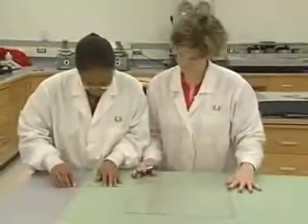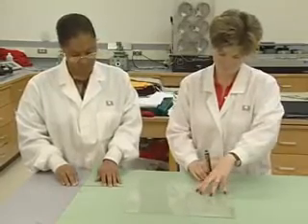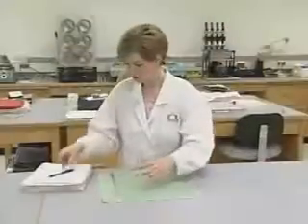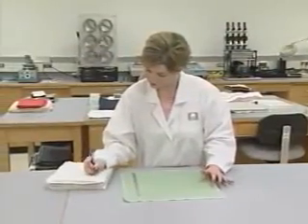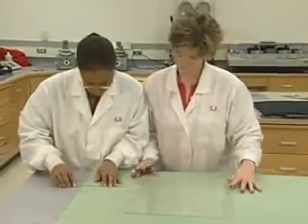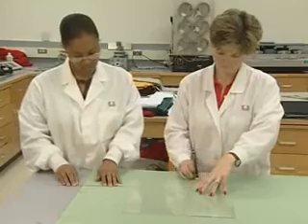The procedure for measuring dimensional changes has 4 steps. These include a preparation step, a testing sequence, an evaluation process, and a data recording process. In the preparation step, samples already properly conditioned must be carefully and consistently handled.